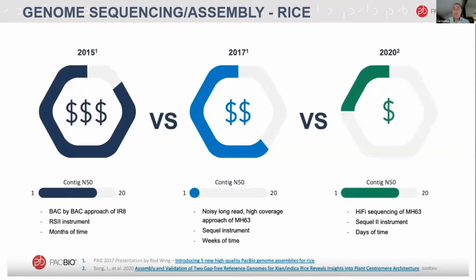So they tended to be slightly more noisy long reads. Again, it cut down the money. It did cut down the time considerably, but because they were noisy, they still got into the magic contig N50 of greater than 1. But you know, they still had some noisy sequence. But let's move on to now, well, 2020, but it's effectively where it is now, really.